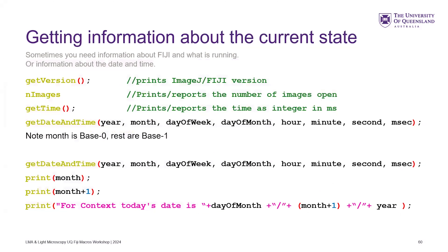There's lots of other useful information we can get in macros. If you're using a complex macro and need to know that the person running it has the right version, you can get the version number — that's quite useful. `nImages` tells you how many images are open. `getTime` we've covered — it just gets the time in milliseconds. `getDateAndTime` we covered; it has day of week, day of month. Note that month is base zero, not base one, so February is actually month one — that's confusing. I would normally just print `month + 1`. It gets a bit annoying but that's the reality.